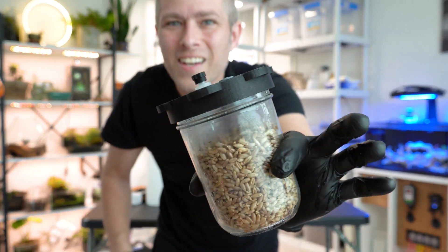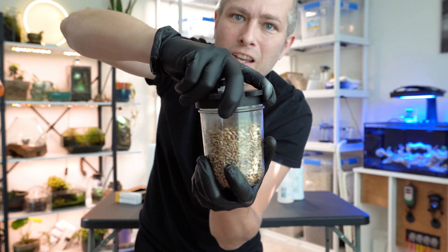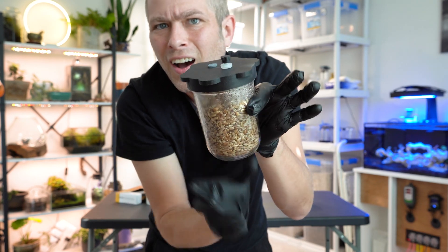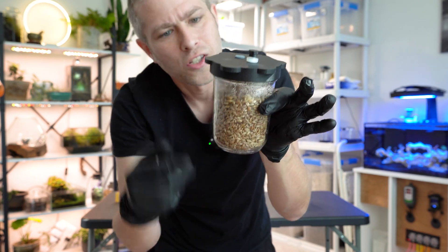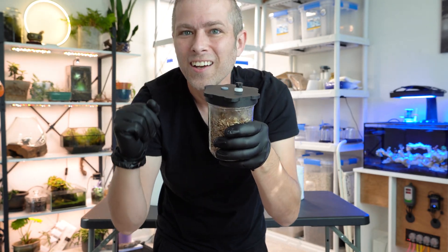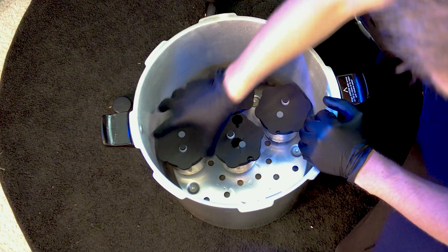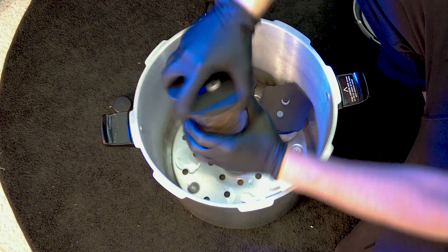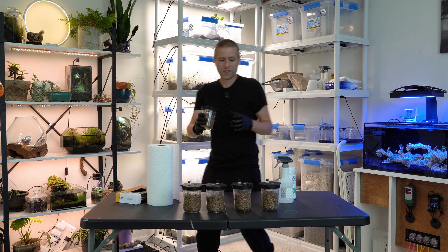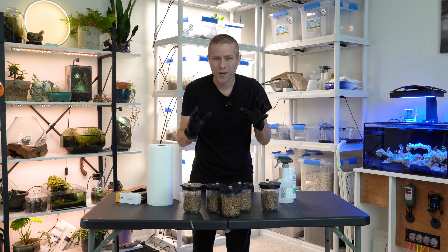We've got pressurized grain jars. The first thing you've got to do when we take these out of the pressure cooker is twist the lid nice and tight. We left it a quarter turn unsealed when we put it in the pressure cooker, just so all that pressure could get in there and sterilize this grain. So for each one of these as I pull them out, I'm going to seal them up nice and tight. That's pretty much all there is to pressure cooking and sterilizing your grain in preparation for our button mushroom grow.